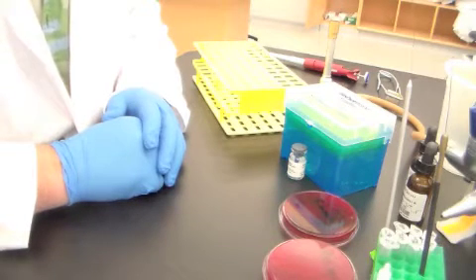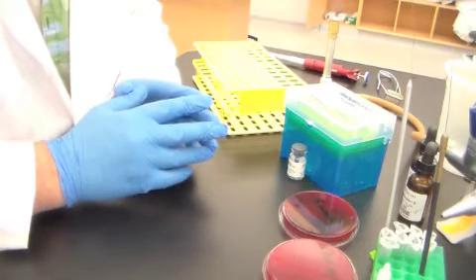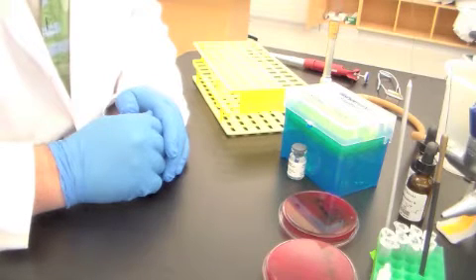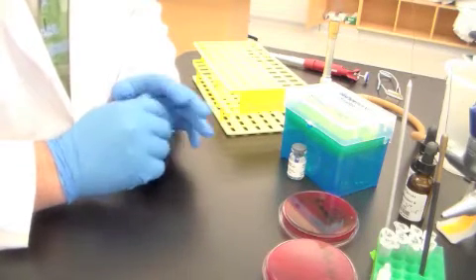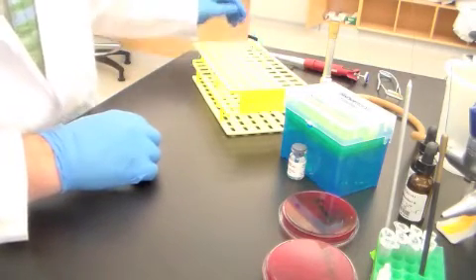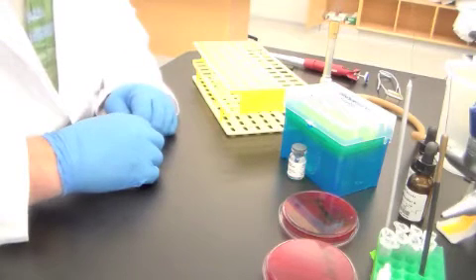But this is a good exercise to do first in the laboratory this week, because this test can take an hour to an hour and a half to occur. So if you do this one first, you have the best chance of seeing the results before you leave for the day. So that's the coagulase test.